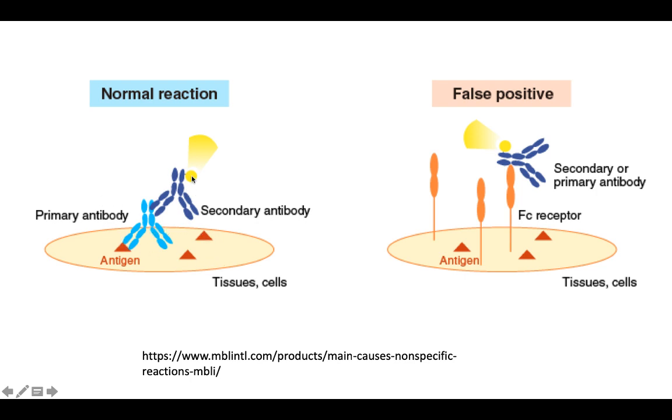these primary antibodies would go and bind onto the antigens. And then when I add the secondary antibody, these secondary antibodies would bind to only the primary antibodies, because the specificity is designed in such a way. And in the negative control, what I would do is just use a secondary antibody. So I know that the secondary antibody would only bind to the primary and nowhere else. So I can make out the difference and then subtract the data and ignore any non-specific interactions.